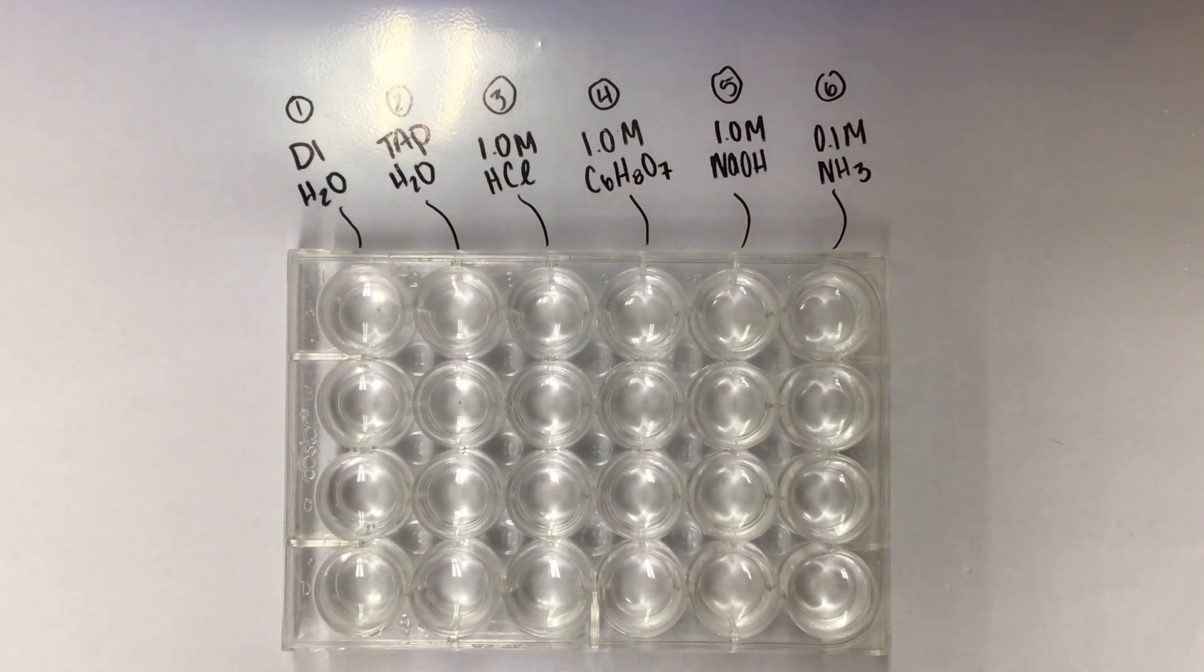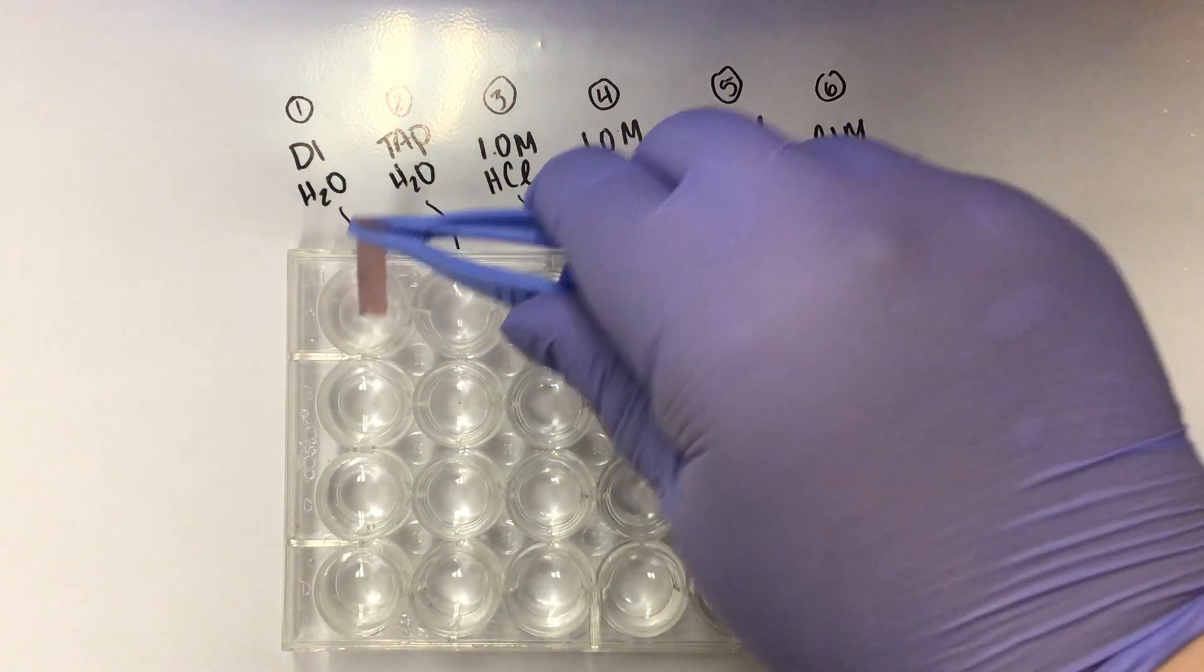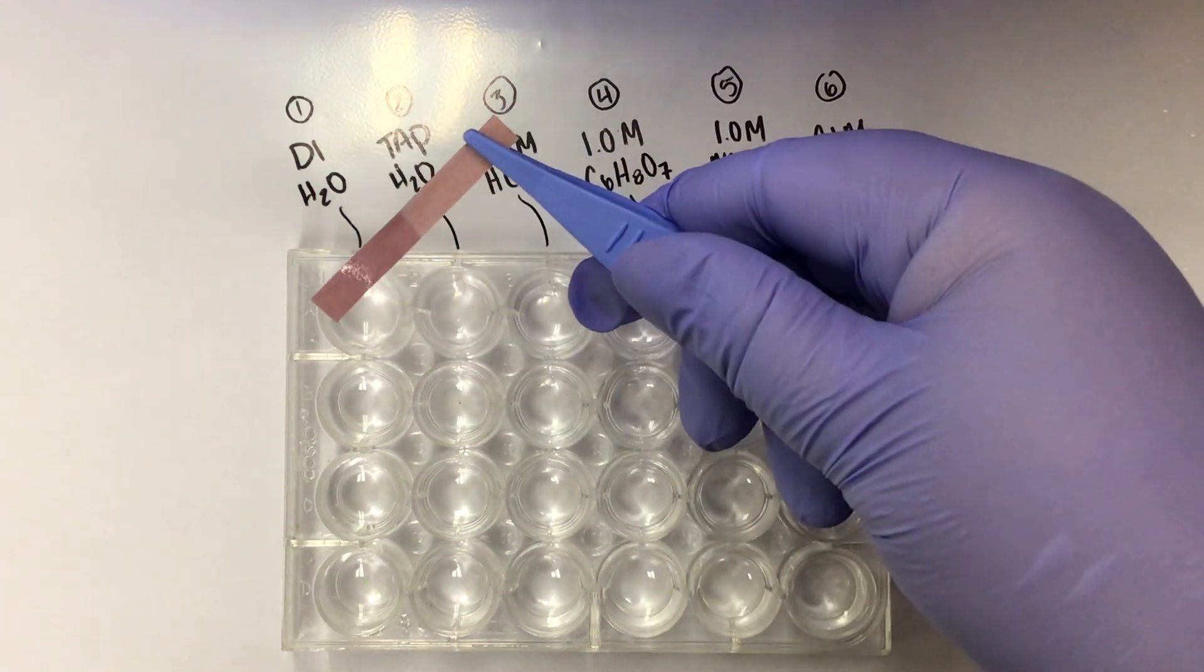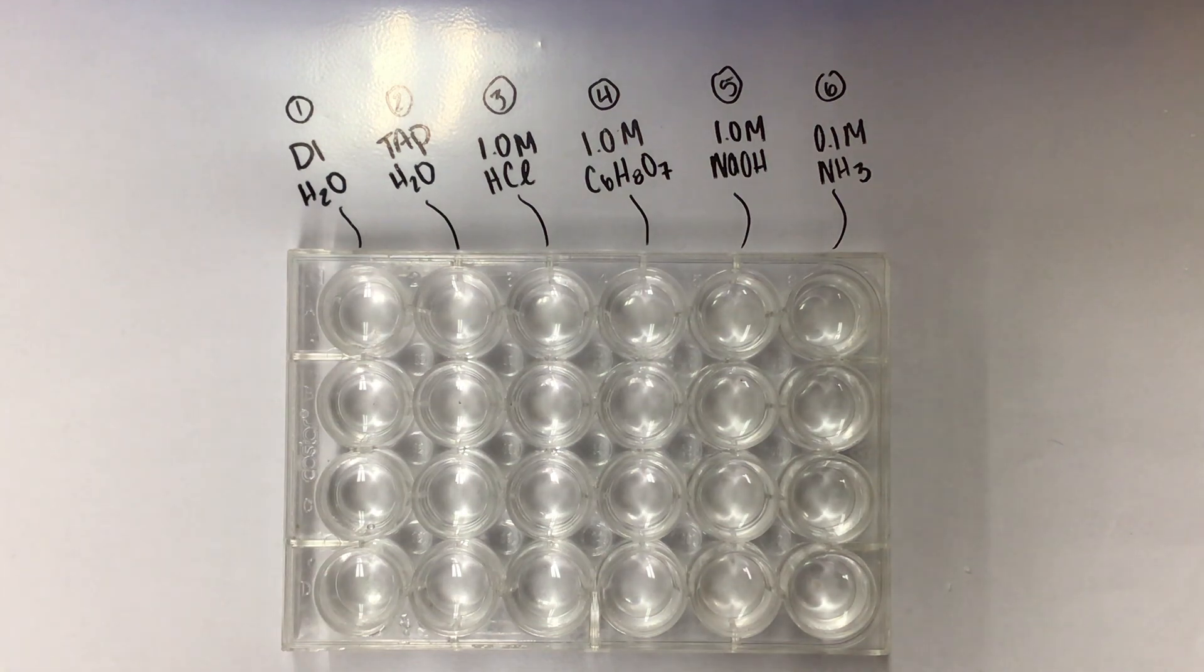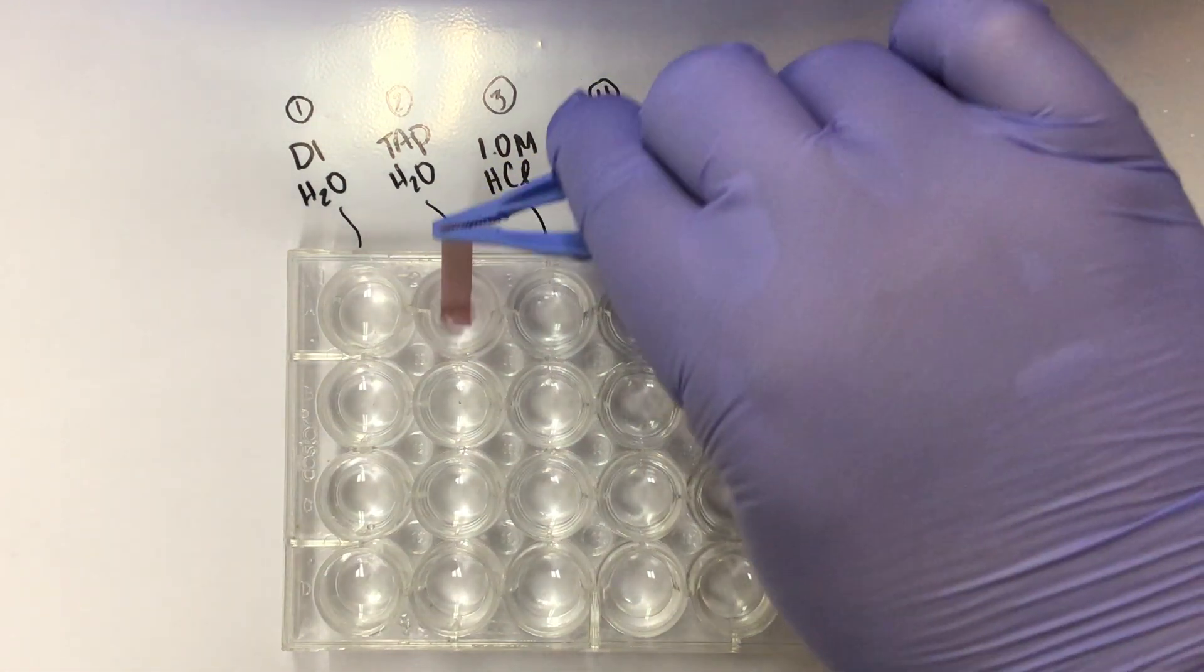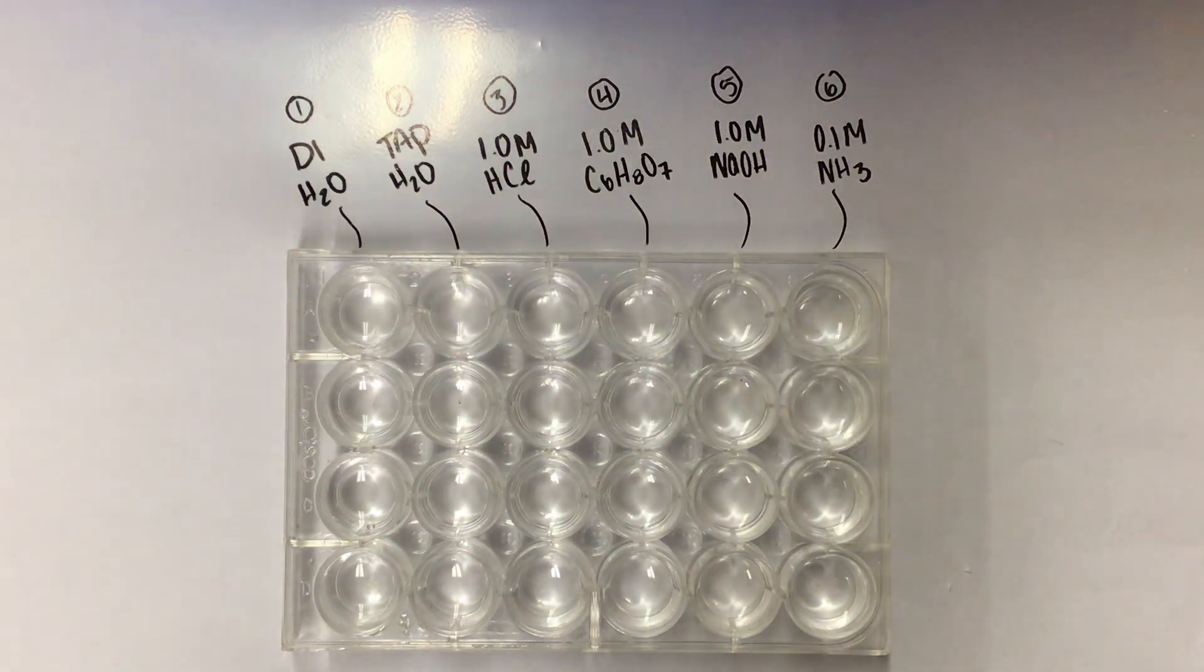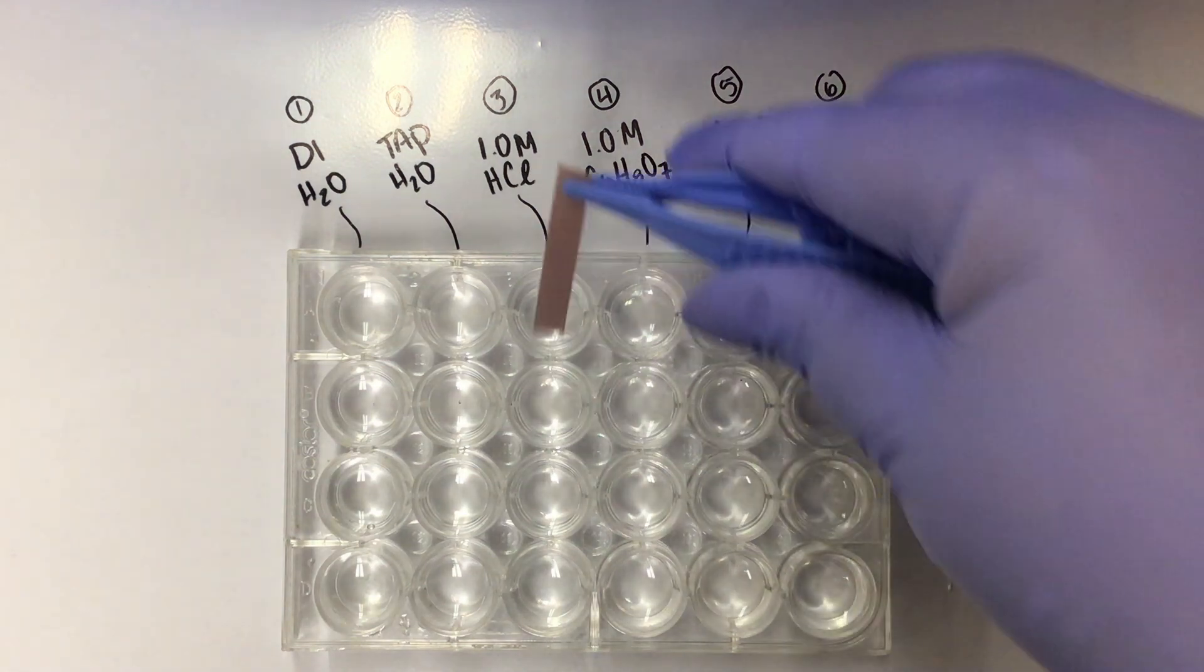Next up, I am going to do the blue litmus paper test. Here we go, starting out in water. Water again, this time tap. HCl.